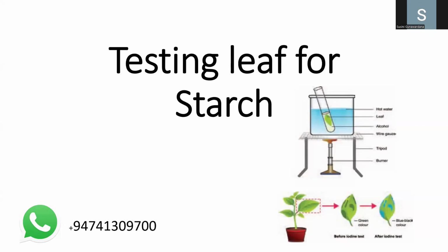Hello. Today we are going to talk about testing a leaf for starch. Plants are unique organisms that can produce their own food through a process called photosynthesis. I think you have a deep idea about the process of photosynthesis. During the process, green plants use sunlight, carbon dioxide, and water to make glucose. This glucose is often stored in the form of starch, especially in the leaves.